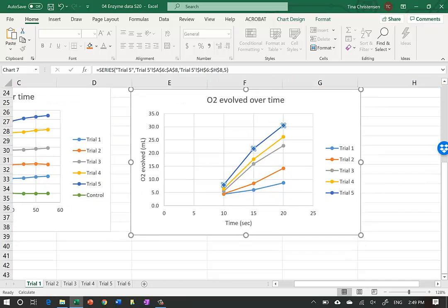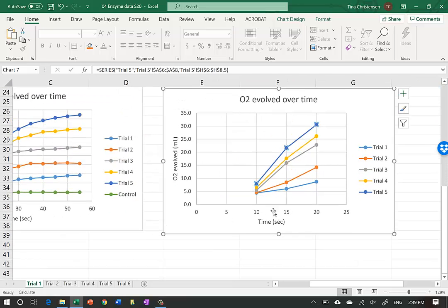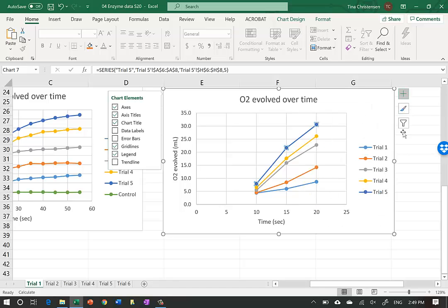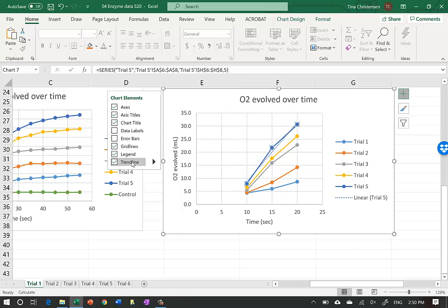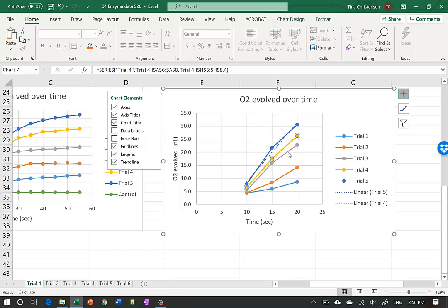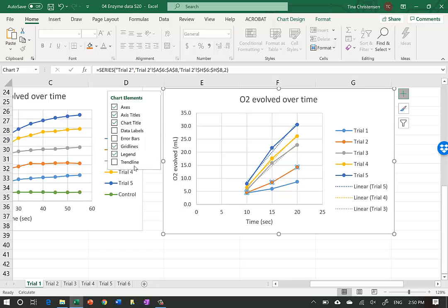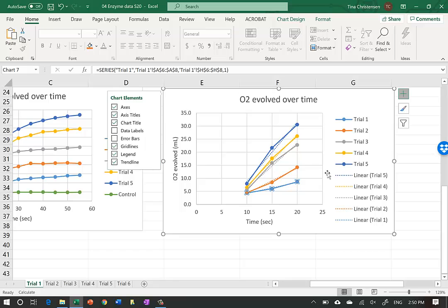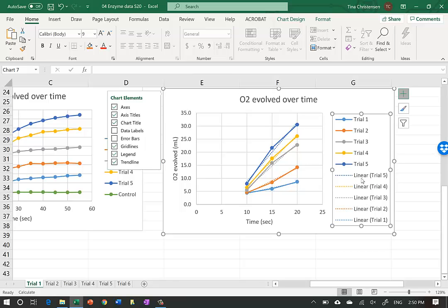Now we have the data from 10 to 20 seconds and we can put in best fit lines. I click the plus sign and tell it to add a trend line for each series. I click on each line and add a trend line, doing this for all five trials. It gets a bit messy with the trend lines showing up, so I'll clean those up.